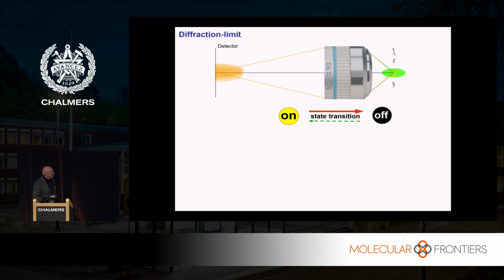In the case of fluorescence, you have to put them in a molecular state in which they are not capable of producing the light back. So in simple words, you have to find a way to turn some of the molecules off. For example, turn all these molecules off but this one, and then you can separate this molecule from the rest. And then, of course, the system can behave as though it had addressed just this molecule. And then you can sort out this mess in here, and you get a signal just from that molecule.